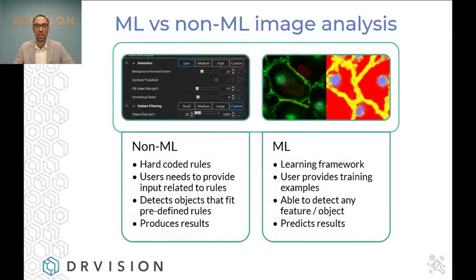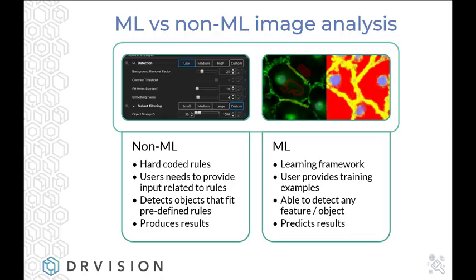So I'll stop here, and I'll get Mike to join me to go into the detail of machine learning a pixel classifier. So let me get him here.